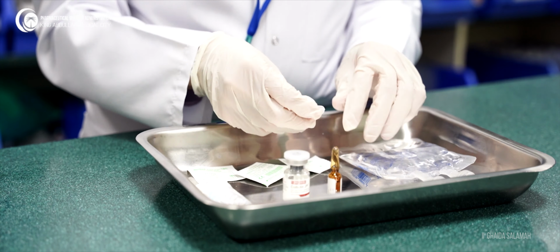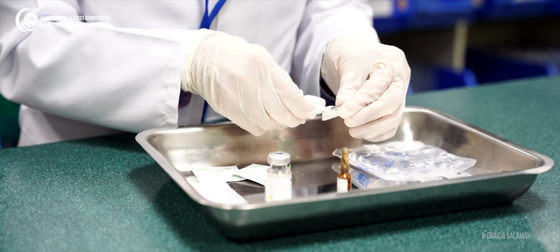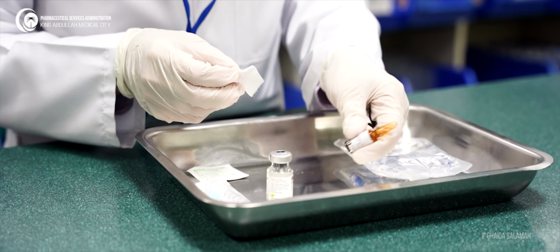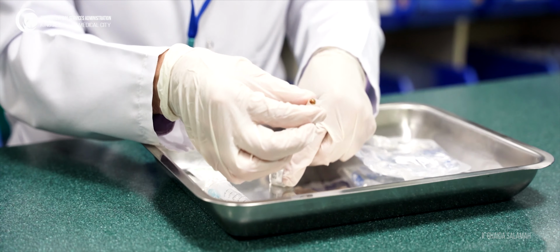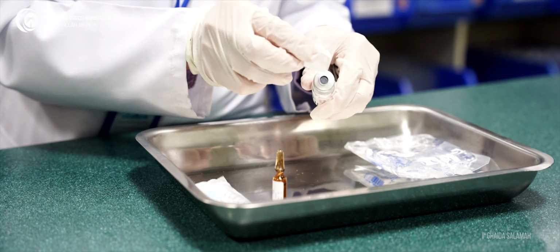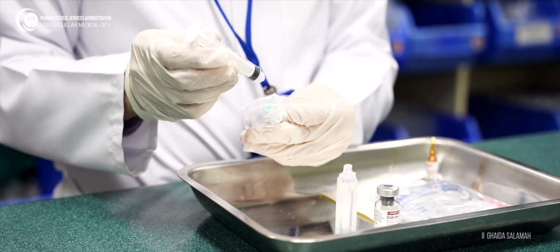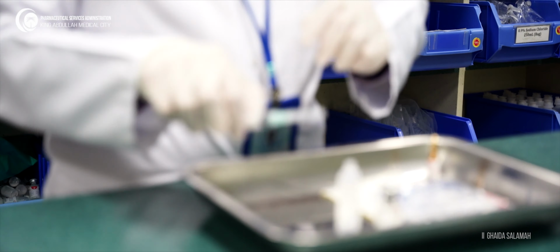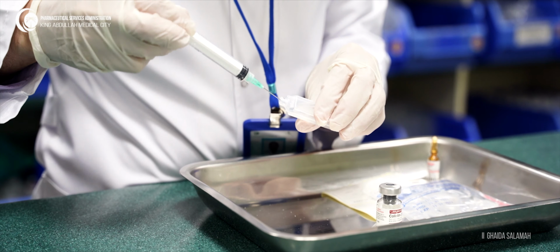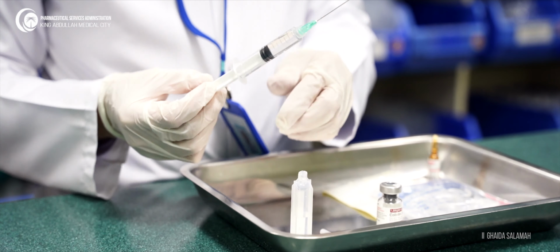Then uncap the vials and bag. Then using an alcohol swab, you should wipe each critical part of each piece of equipment with this alcohol swab 3 times in the same direction, and it is very important to allow it to dry. Remove the syringe from the package without touching the critical parts, the tip and the needle. Then remove the liquid to dissolve the powder, also keeping the needle without any touch. Also, don't touch the plunger while you withdraw.